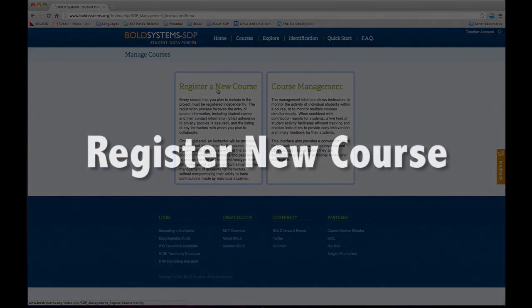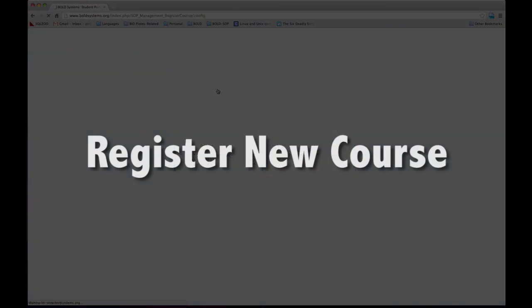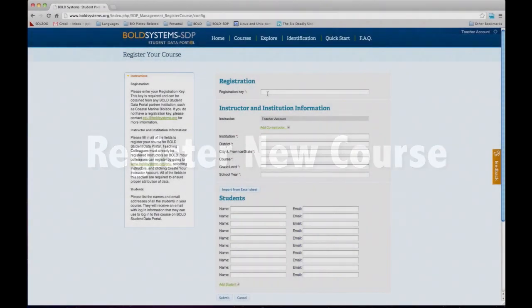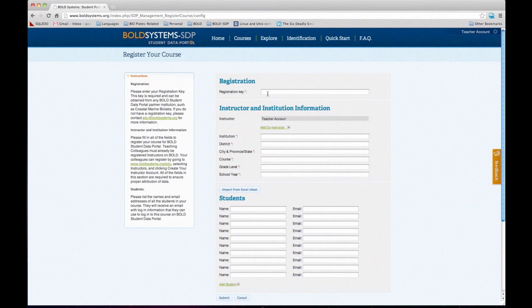Let's get started by registering your course. Here we're going to register a new course. Once you create an account on Bold, you receive an email from us — either myself or Mallory — with registration keys. To create a course, you need to enter these registration keys. If you don't have registration keys or if you run out, please let us know and we can provide more as necessary.